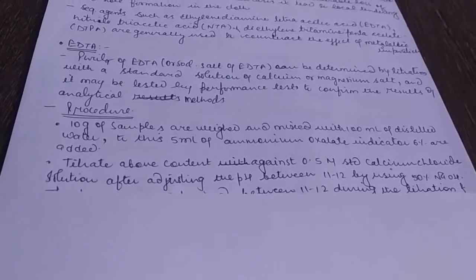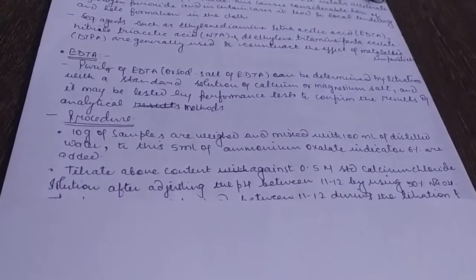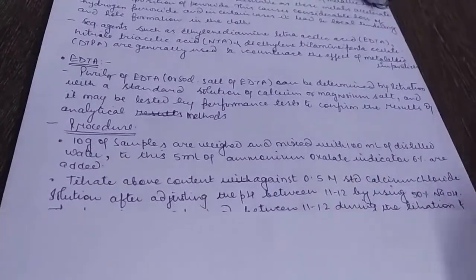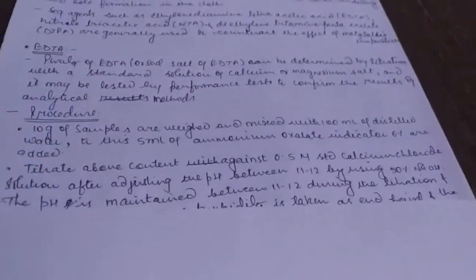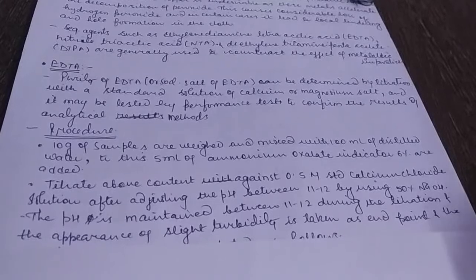As all of you know, the amount of NaOH will be added according to this pH. The pH is maintained between 11 and 12 during the titration, and the appearance of slight turbidity is taken as the end point.